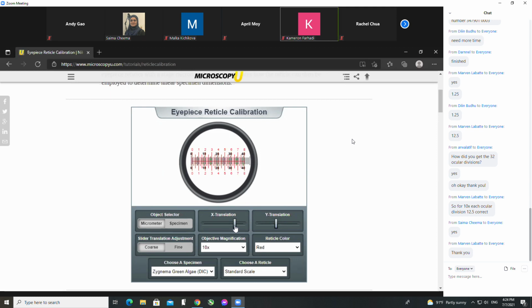So this is basically under 10x. Okay, you see my screen? Yes. Okay, so you can write down what you're seeing with this, which I guess we already did. Now let's move it to 40. You don't really have to do anything. It just stays there. Just count.